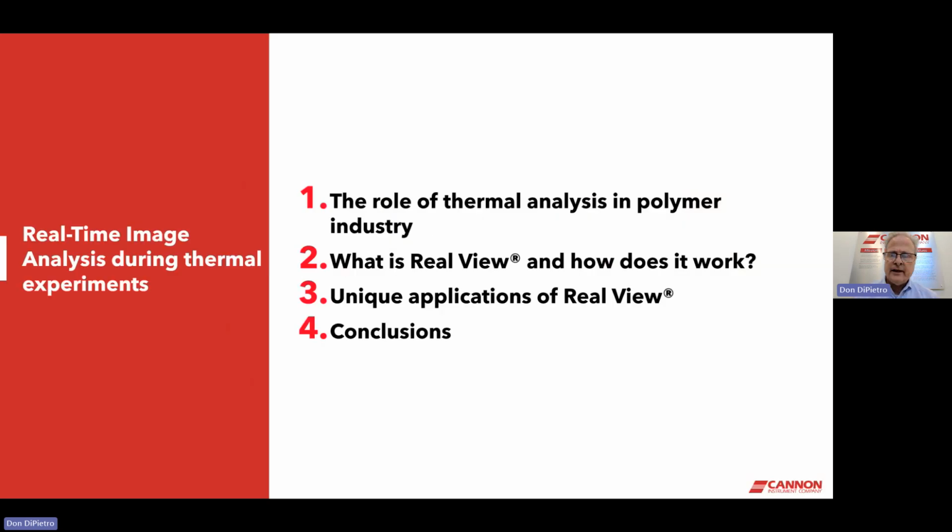I'm going to talk really quite shortly. I expect that most of you know the role that thermal analysis plays. I think you probably wouldn't be here unless you were already doing thermal analysis. So I probably have just one slide on that. We'll talk about how RealView works. And by the way, we coined the term RealView. RealView simply means image analysis.